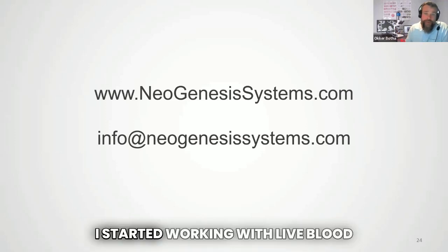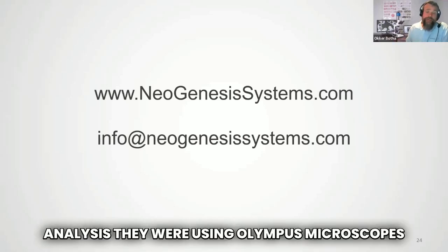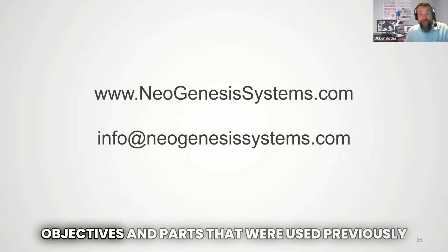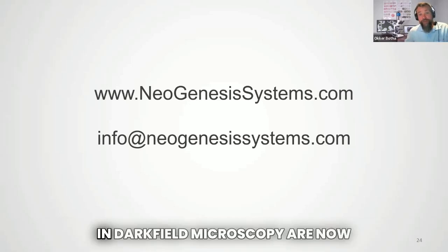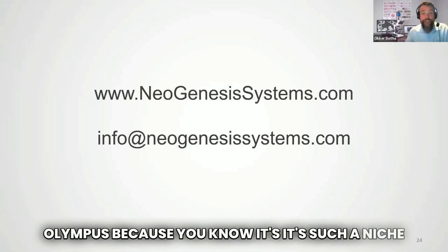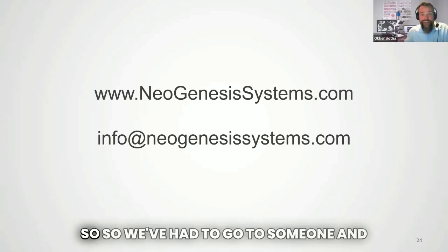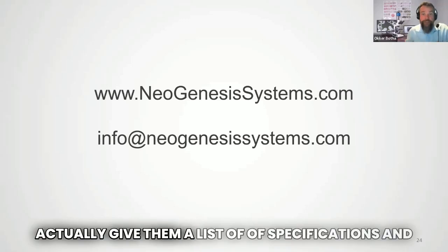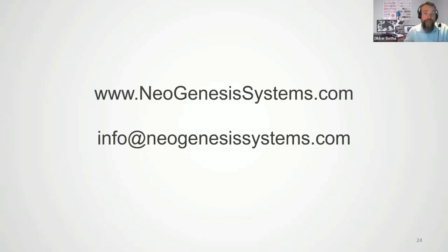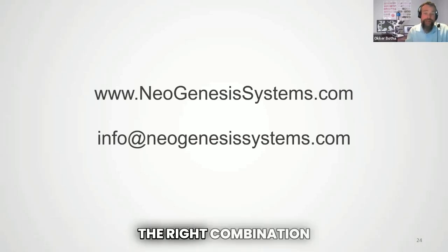Way back when I was training in live blood analysis, they were using Olympus microscopes, but a lot of the objectives and parts that were used previously in dark field microscopy are no longer available from Olympus, because it's such a niche application that it's not really feasible for them to produce it. So we've had to give someone a list of specifications and get them to produce it accordingly, which also means that other dark field microscopes often don't have exactly the right combination.